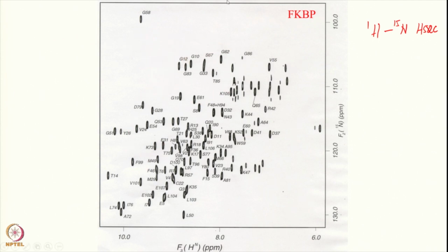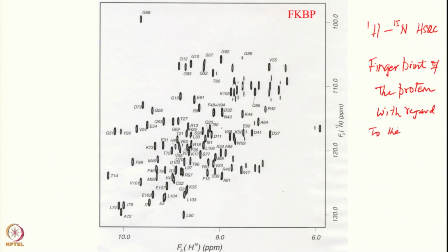Therefore this experiment is called the fingerprint of the protein with regard to its primary structure, that is the amino acid sequence.